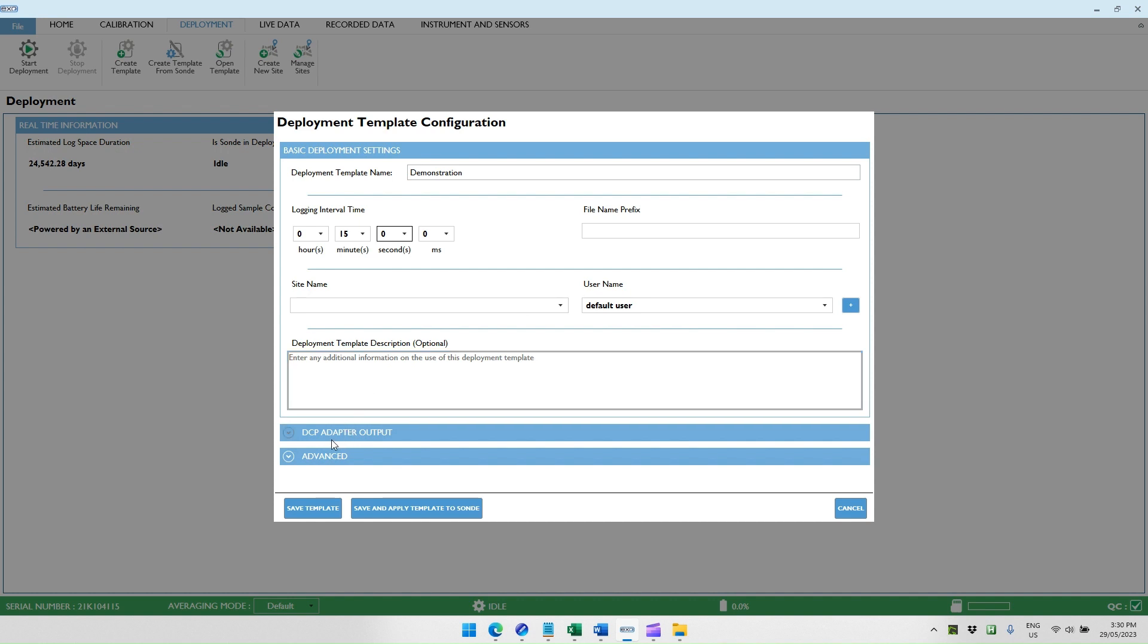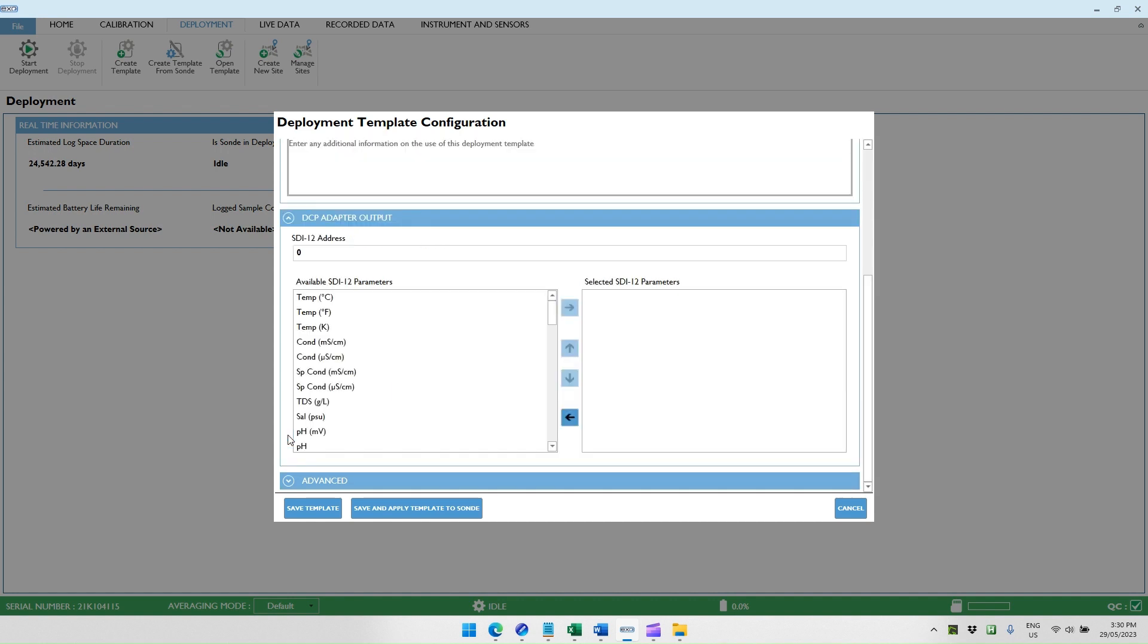Then we have two tabs. One called the DCP adapter output, which is relevant if we're using the SDI-12 interface. And then we also have the advanced tab, which is where we set up the output mode of the sonde. Assuming we have an SDI-12 suitable sensor, we can look at the DCP adapter output section. Here, we set the SDI-12 address. Most commonly, that is zero, but it can also be one if you've got multiple sondes connected to the system.